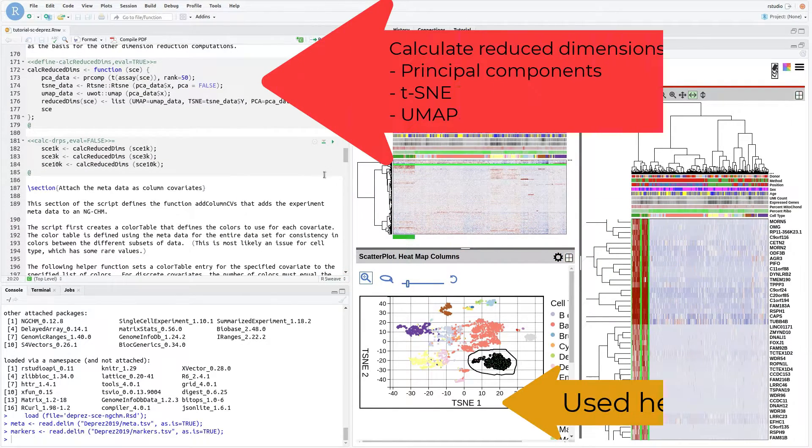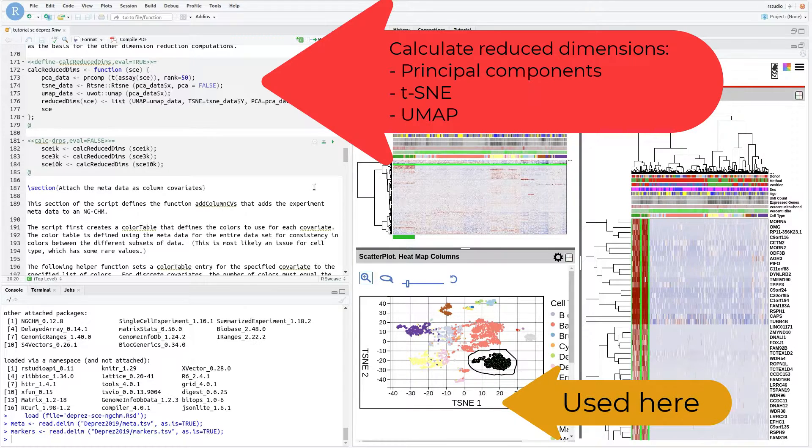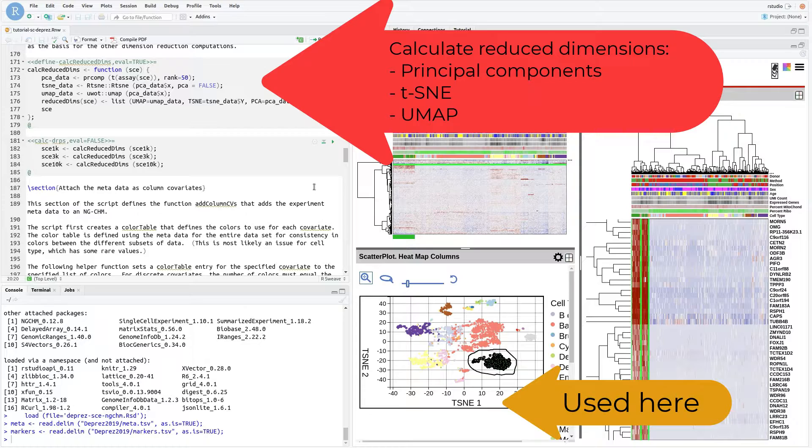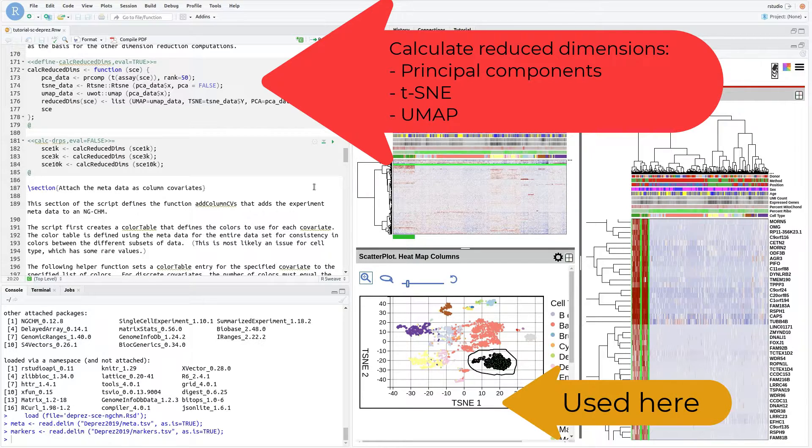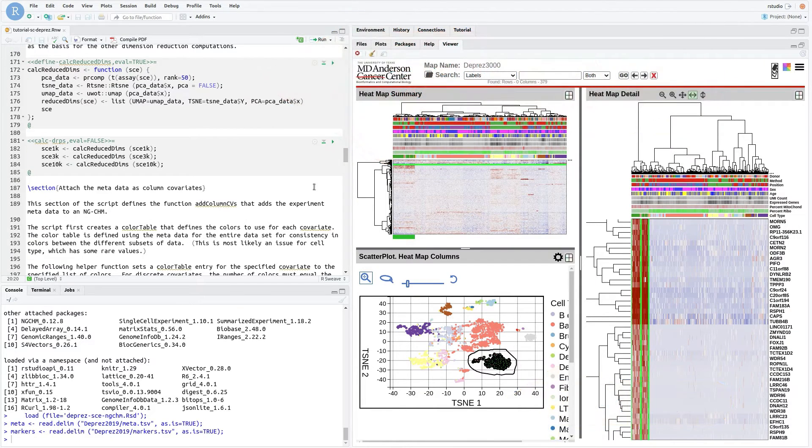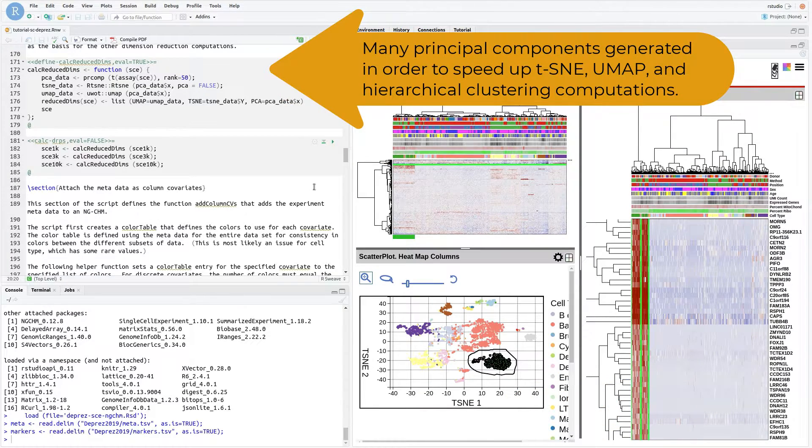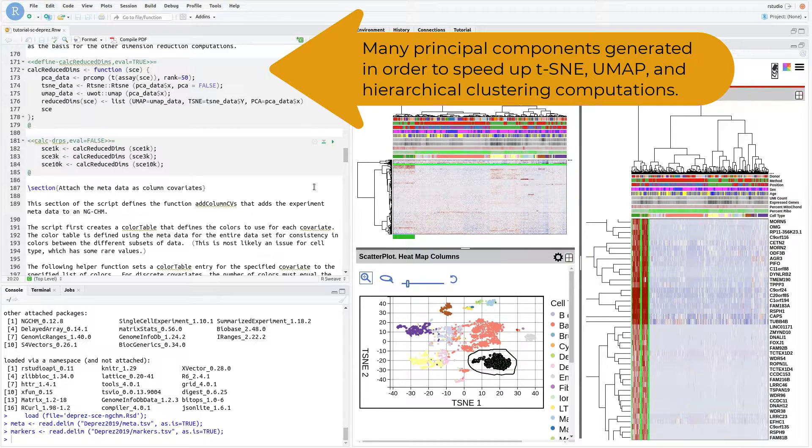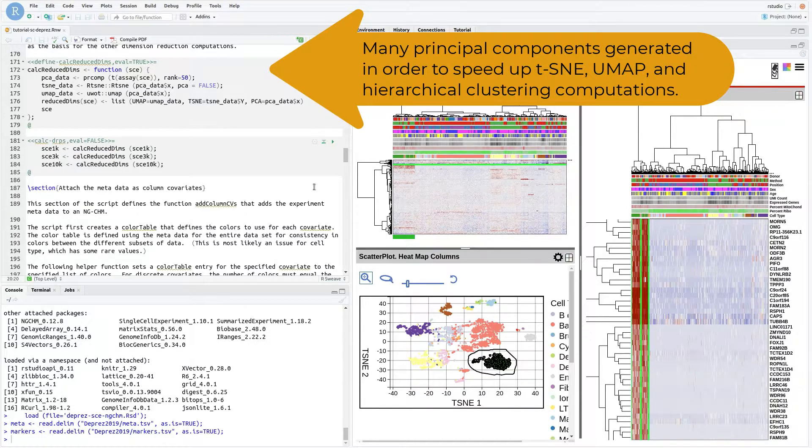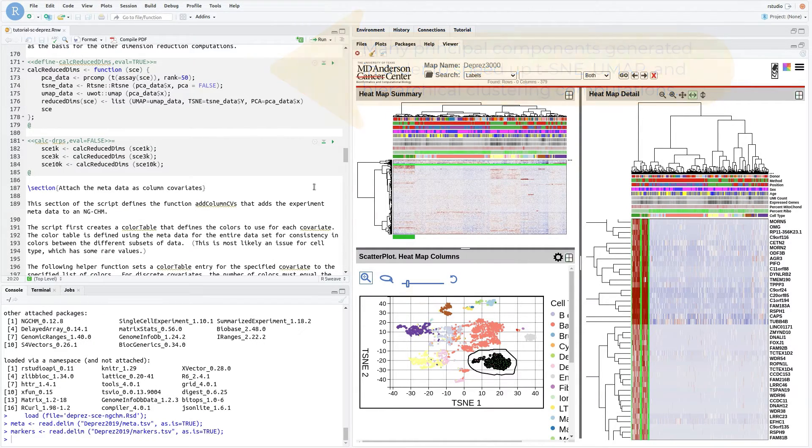The next step calculates several forms of reduced dimension data, including principal components, t-SNE, and UMAP coordinates. Recall that the GenHM function described above adds each of these components to the NGCHM. A relatively large number of principal components are generated so that they can be used in place of the unreduced data to speed up the t-SNE, UMAP, and hierarchical clustering computations.